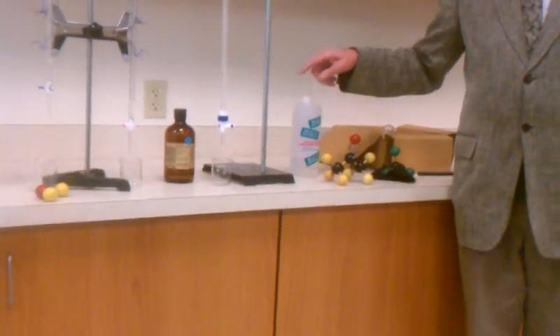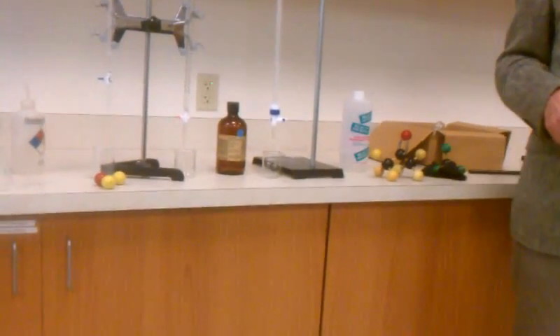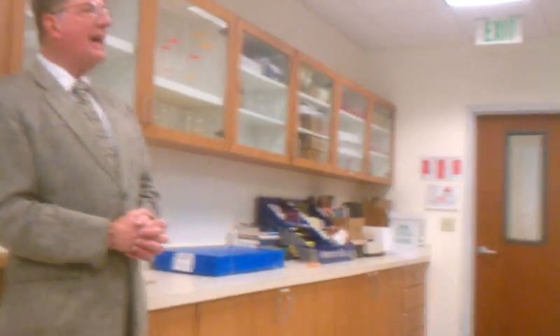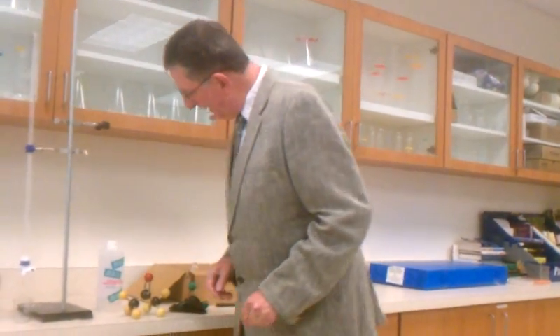I think the stream will be drawn off from it, but not as much as the water? Yeah. No, if it's polar, it's got to be attracted. Oh, okay. But not as much, it won't veer off. Maybe it won't bend as much. Yeah, is what we might predict. Okay, let's see what happens.